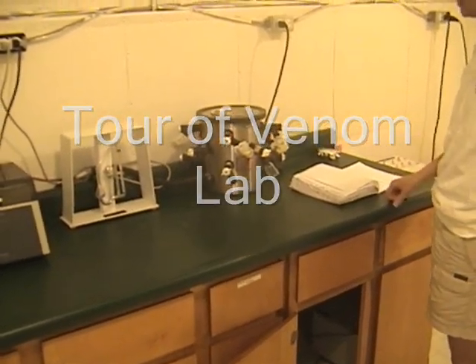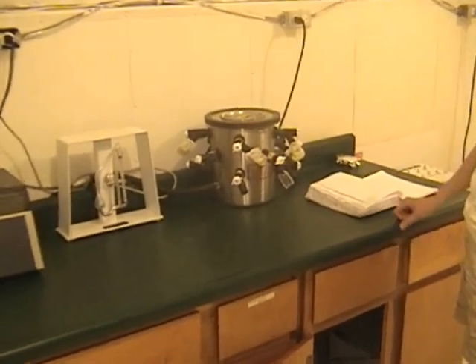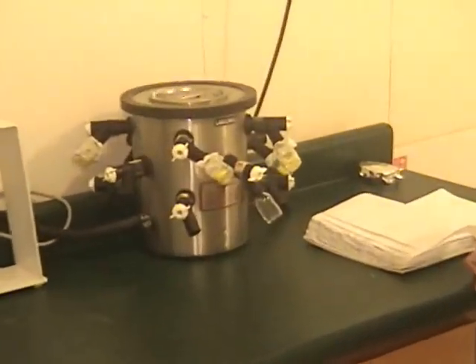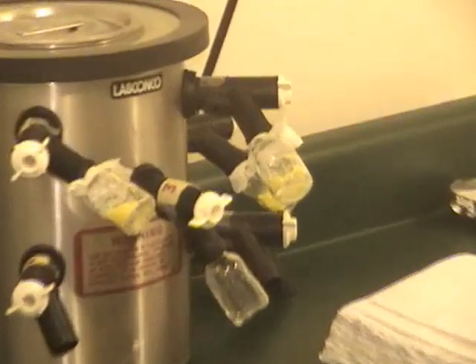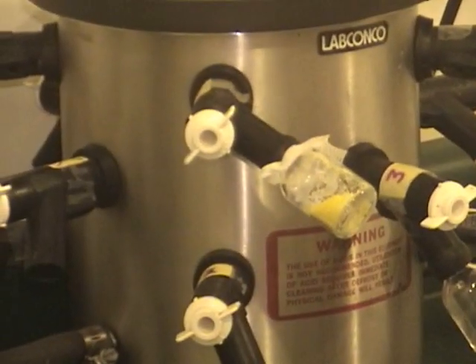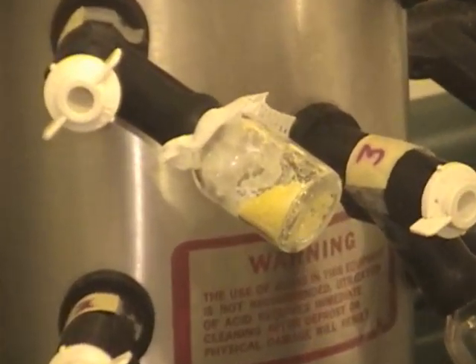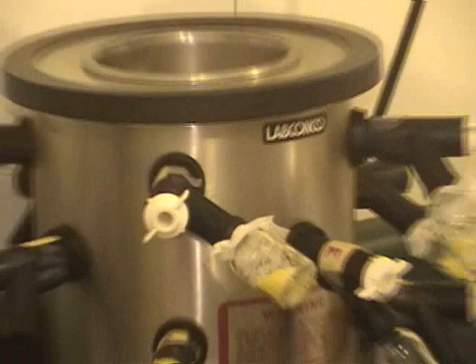This is our lyophilizer machine, and these are vials of venom that are being freeze-dried on there. The way this works is the venom is frozen when you put it on, and inside here is dry ice.